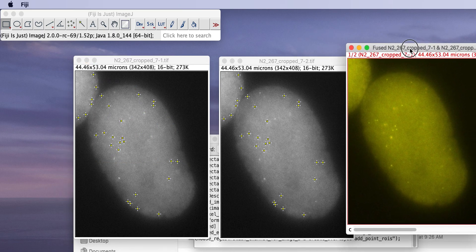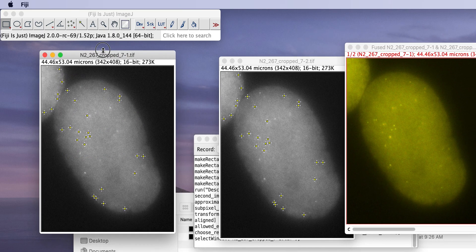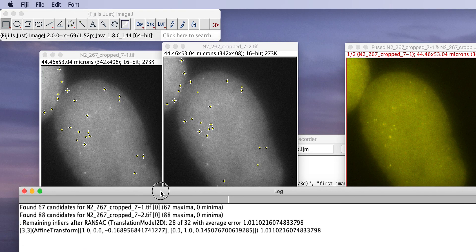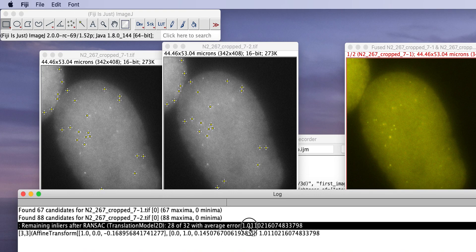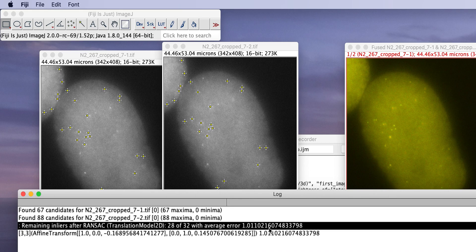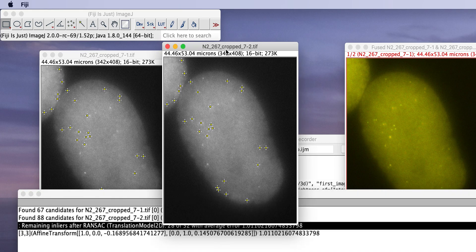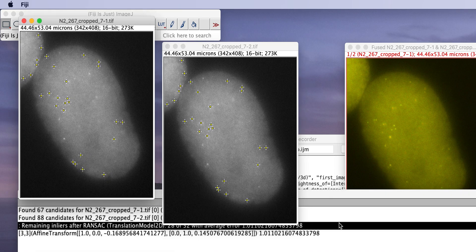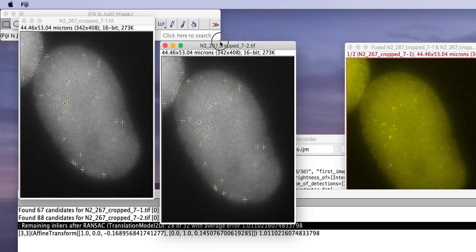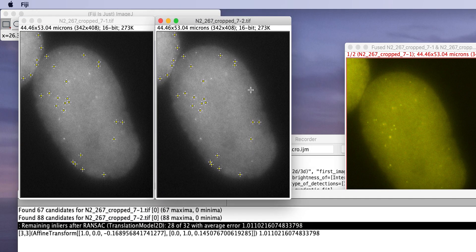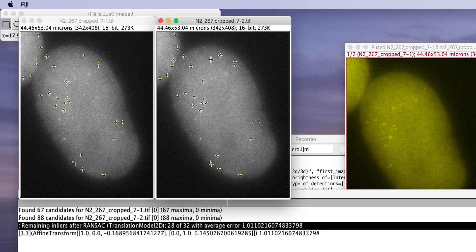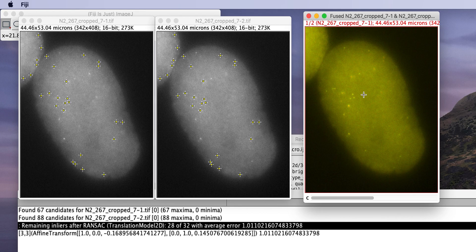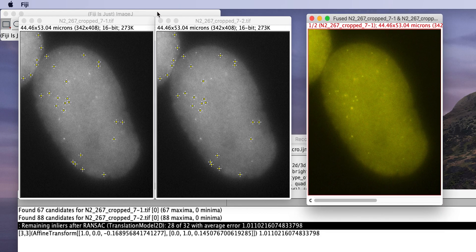And this was very quick. It found those corresponding points. The log window also tells you a bit more about an error of one pixel, 1.1. That's very good. 28 found out of 32. So the outlier filtering with RANSAC found four of the 32 that it thought would be corresponding points to not agree on the transformation model. And these are all the points they found in common. With that, it fused those two images together.